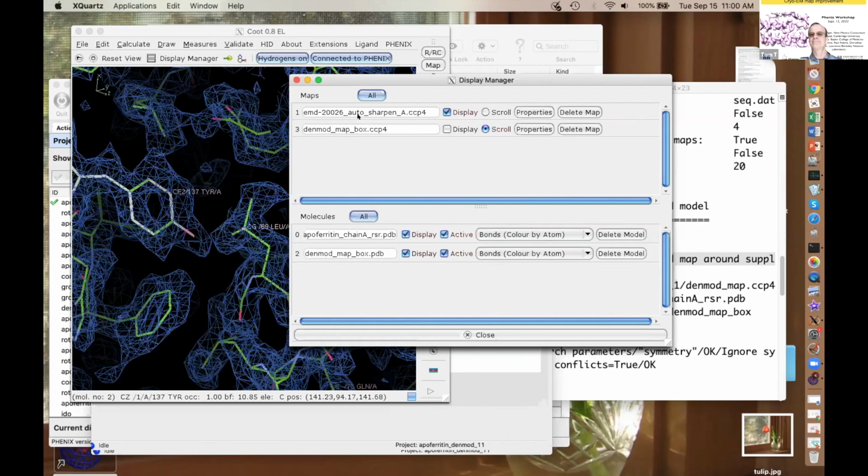Right. Would you deposit a density modified map? That's a longer discussion, but we would advocate people deposit their original map that came out of the reconstruction, deposit the map that you used to interpret to build the model, and half maps. Those are, I think, the minimal things that eventually the community will be required to deposit. It gets more complicated if you have focused reconstructions and stuff like that, but for a straightforward case, those four things are, I think, going to become mandatory.